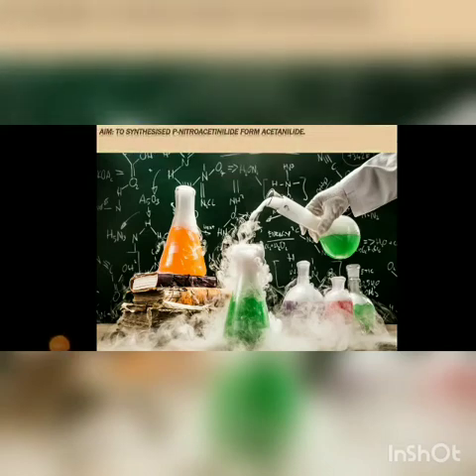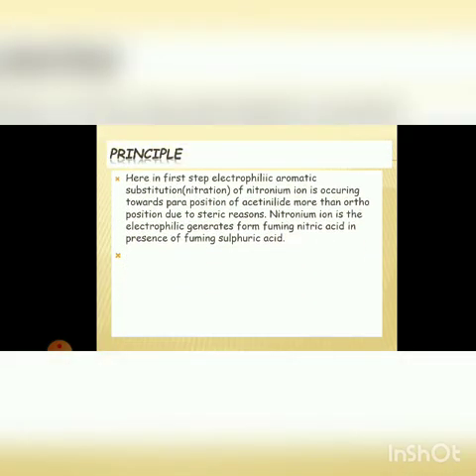Hi guys, again I am going to explain a synthesis procedure and MSDS of the synthesis of p-nitroacetanilide from acetanilide. Here is the principle of this synthesis.